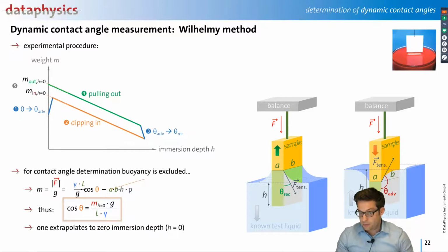So in fact, if we have simple substrates, plate-shaped substrates, for example, then we will just measure the size of it and then put the size in, and then it's absolutely correct, the results. But if we have a super complex surface like a tooth implant that very often also has the gap to screw it in, then what we do is we typically measure in the area where the implant has a cylindrical shape, and then we try only to compare coatings of implants with the same shape with each other.